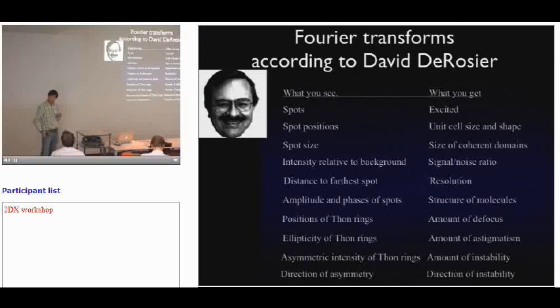A model for the noise in order to define the signal to noise ratio, when you approximate or estimate. Yeah, I think people have tried to look into this more quantitatively. What it boils down to, I think, is still a pretty subjective measure to put in that constant. In the end, it depends very much also on what type of resolution you're interested in. If you're really interested in the high resolution, of course, this constant has to be really low in order to see something. But practically, you roughly determine this manually.